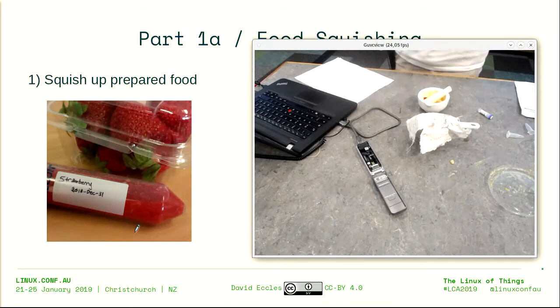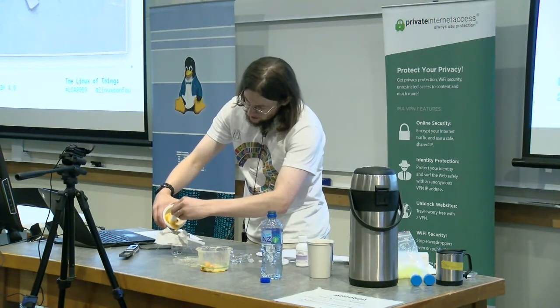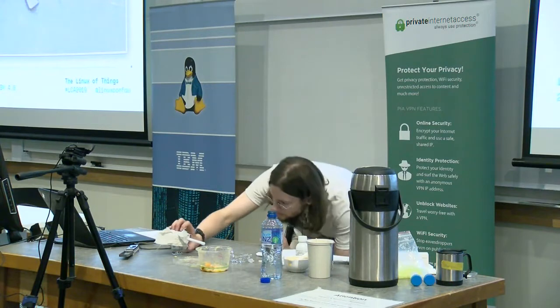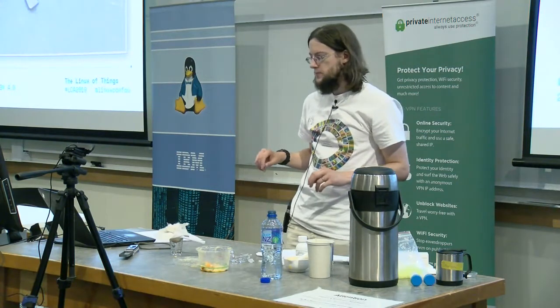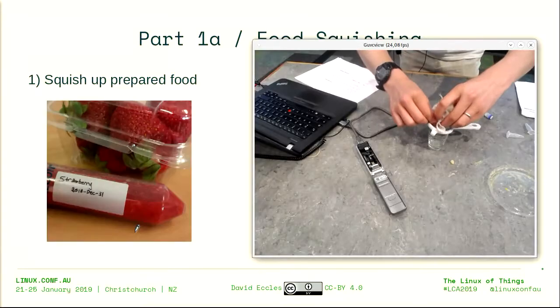So what I want to do is pull the dissolved DNA out and sort of leave all the solid chunky bits behind. Okay, this is dripping a tiny bit. I'm going to rush it a bit by squeezing this sheet. Excuse fingers.